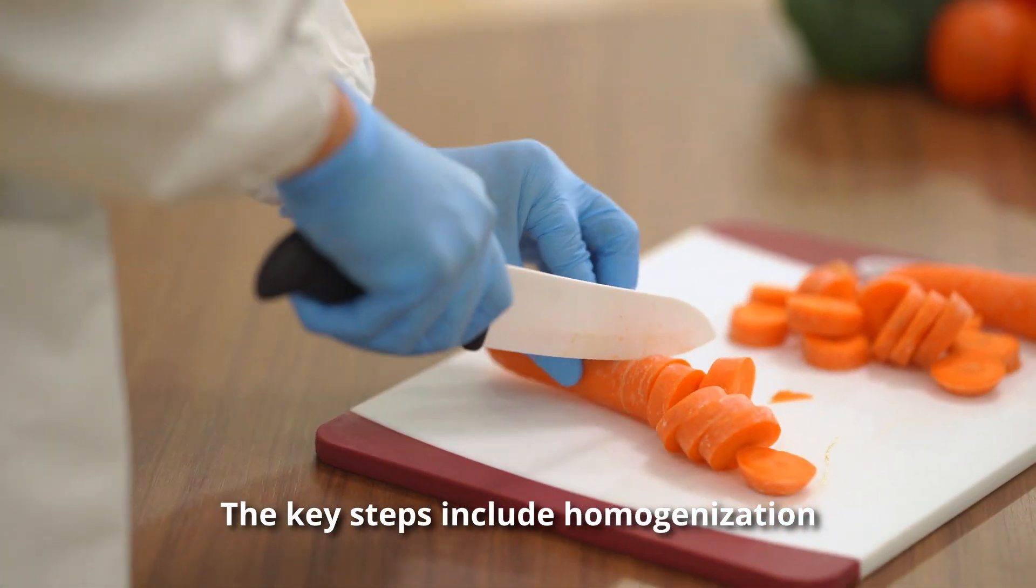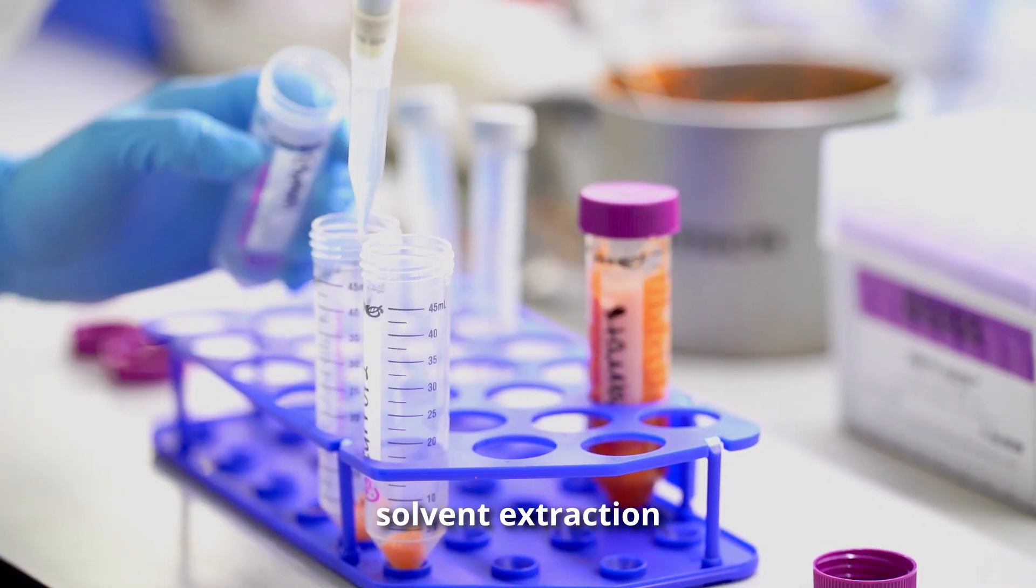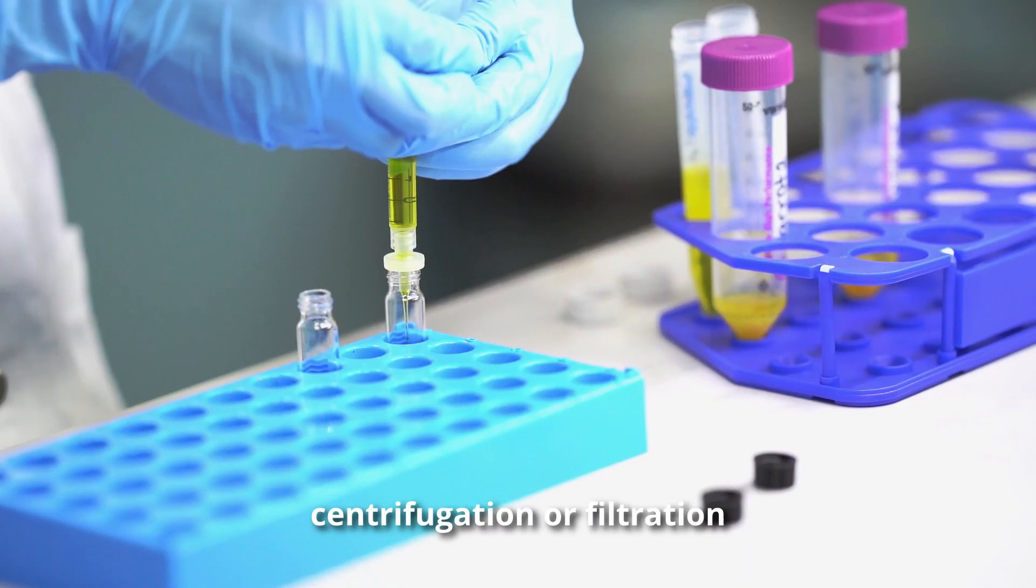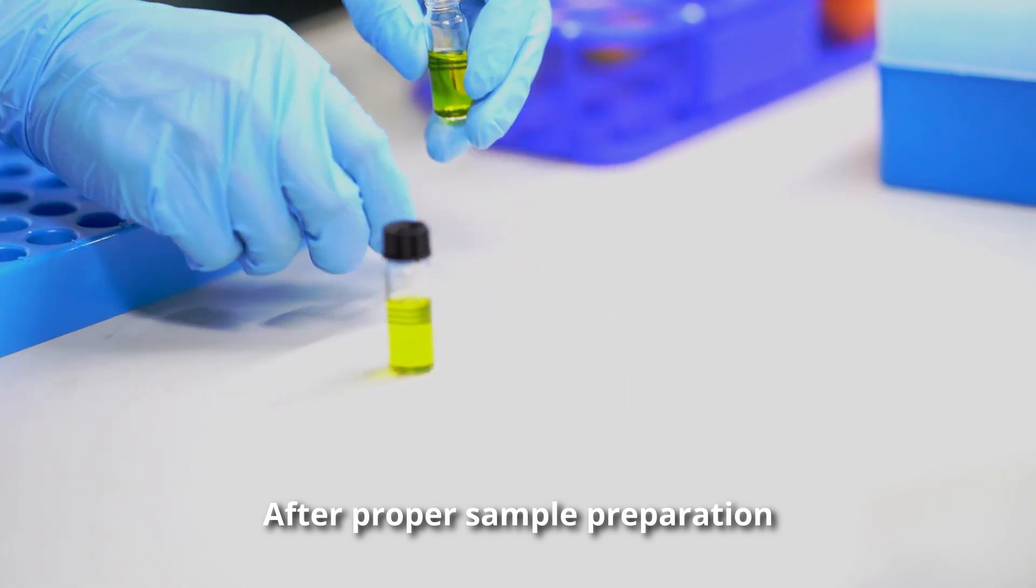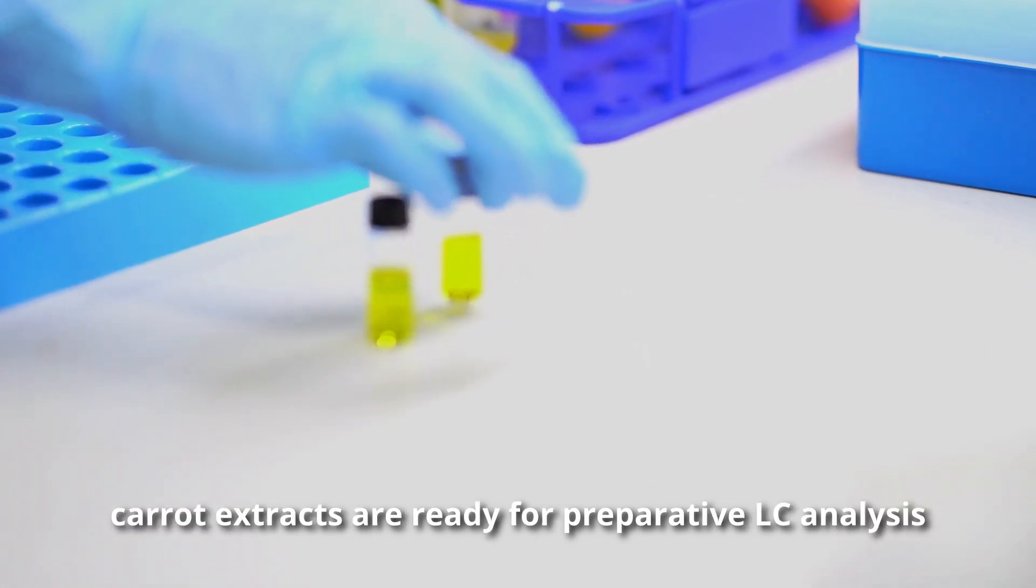The key steps include homogenization, solvent extraction, centrifugation, or filtration. After proper sample preparation, carotene extracts are ready for Preparative LC Analysis.